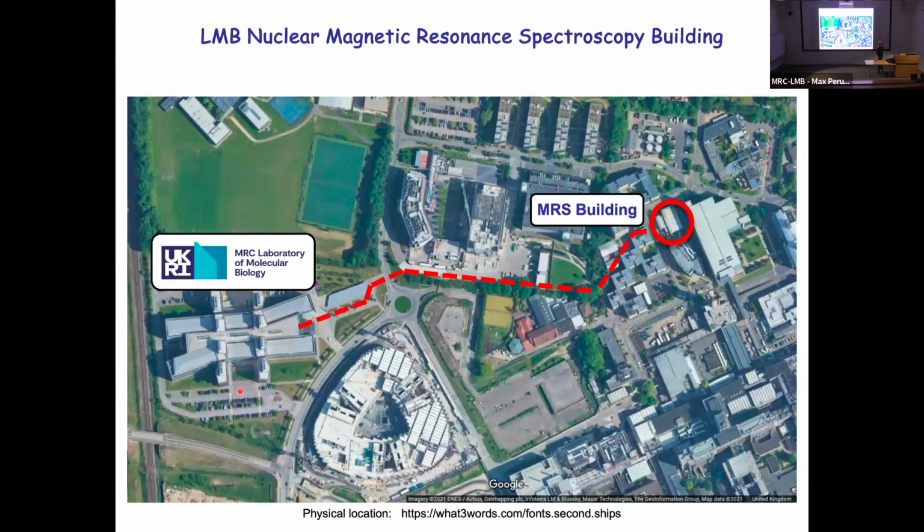We have a very well-equipped NMR facility. We're not based in the main LMB building. We are about 5 minutes walk away in our own purpose-built NMR spectroscopy facility. I should say that on a clinical site, it is unnecessarily alarmist to use the word nuclear in describing nuclear magnetic resonance. If you're trying to put patients inside of a machine that is a nuclear magnetic resonance spectrometer, it tends to cause unnecessary alarm. So we ditch the word nuclear and just call it magnetic resonance spectroscopy. So we're more likely to refer to it as the MRS building.